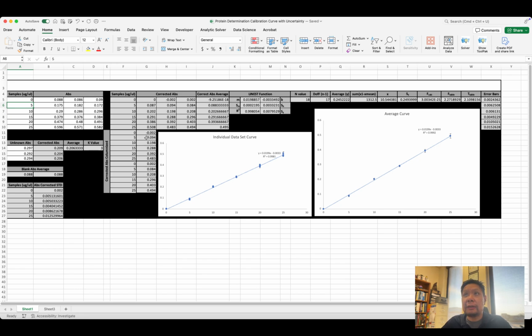And then same with this here, right? These are just referencing those cells of each of those concentrations, but just in column form. So here's the one for the third trial right here. So I5, I6, and so on, I7, I8, I9. And you can see how it highlights. And literally, I just put these in column form just so that it's easier to type the equation in for the different statistical parameters.